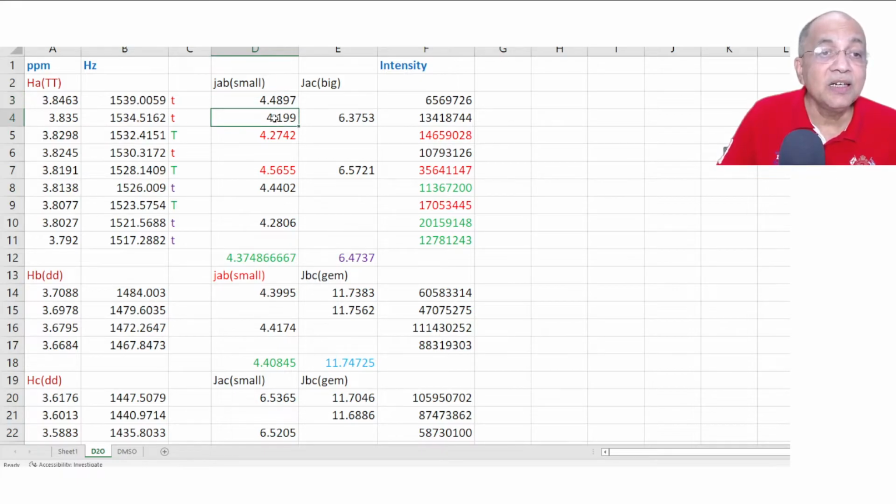And here it is not B5, because the next line is here. This is B4 minus B6, this minus this, right? And then you can also go for this and this. This is B5 and B7. And you can go for this and this. That is B7 and B9.